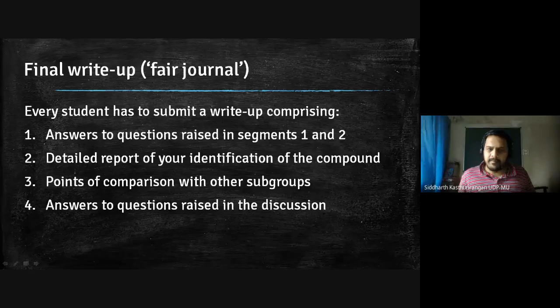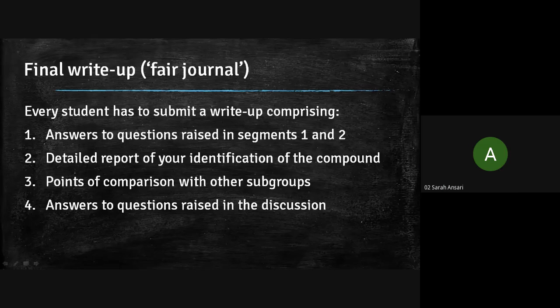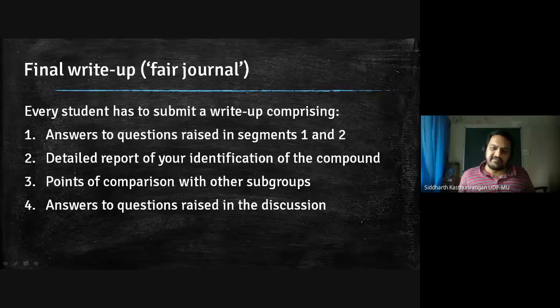Sir, you said बोलिए. You said that there is a difference between IR and NMR spectra of 1-butanol and 2-butanol. Yes, there will be. IR will be the same just because there is the same shifting due to the OH group, right? Yes. And NMR will be different just because of different coupling of H, because the surrounding of the H is different. I was talking about propanol and isopropanol. Isobutanol will be slightly more complicated, but I was talking about propanol and isopropanol.